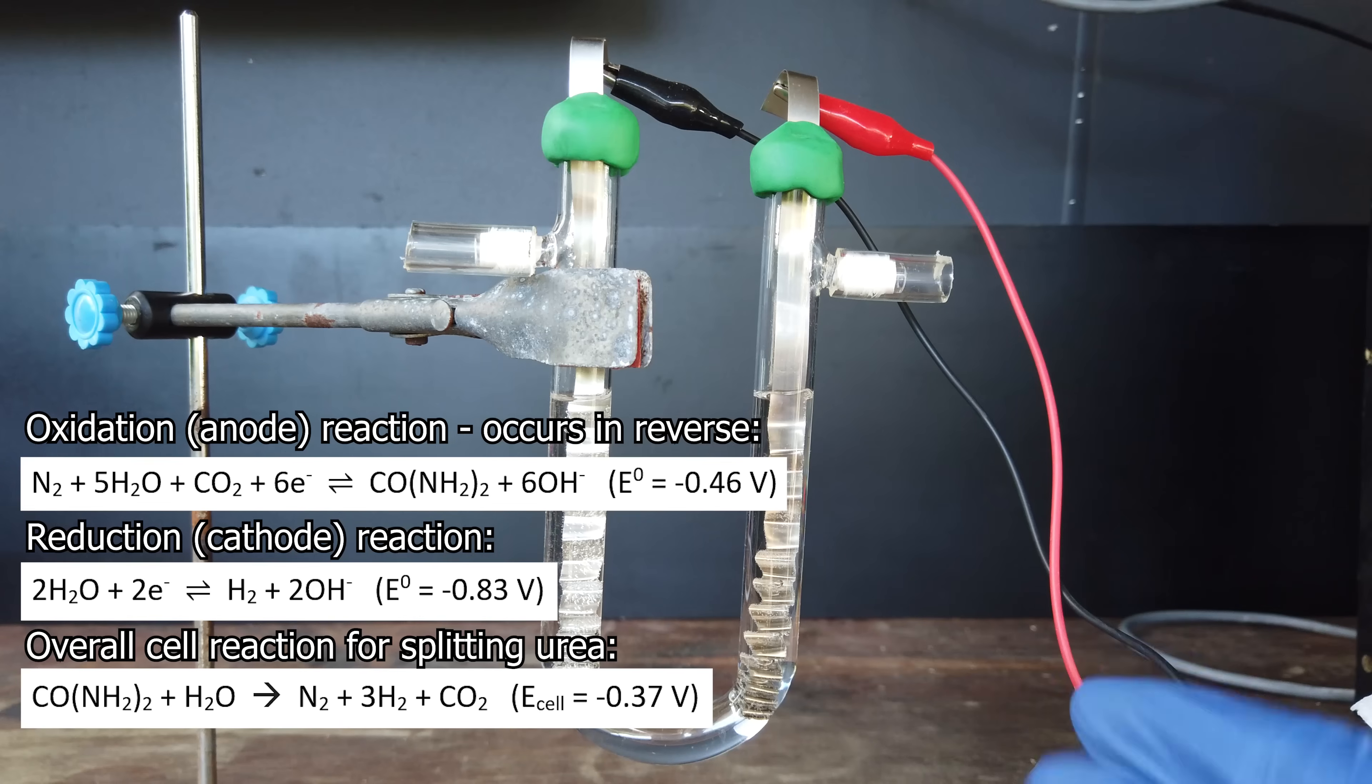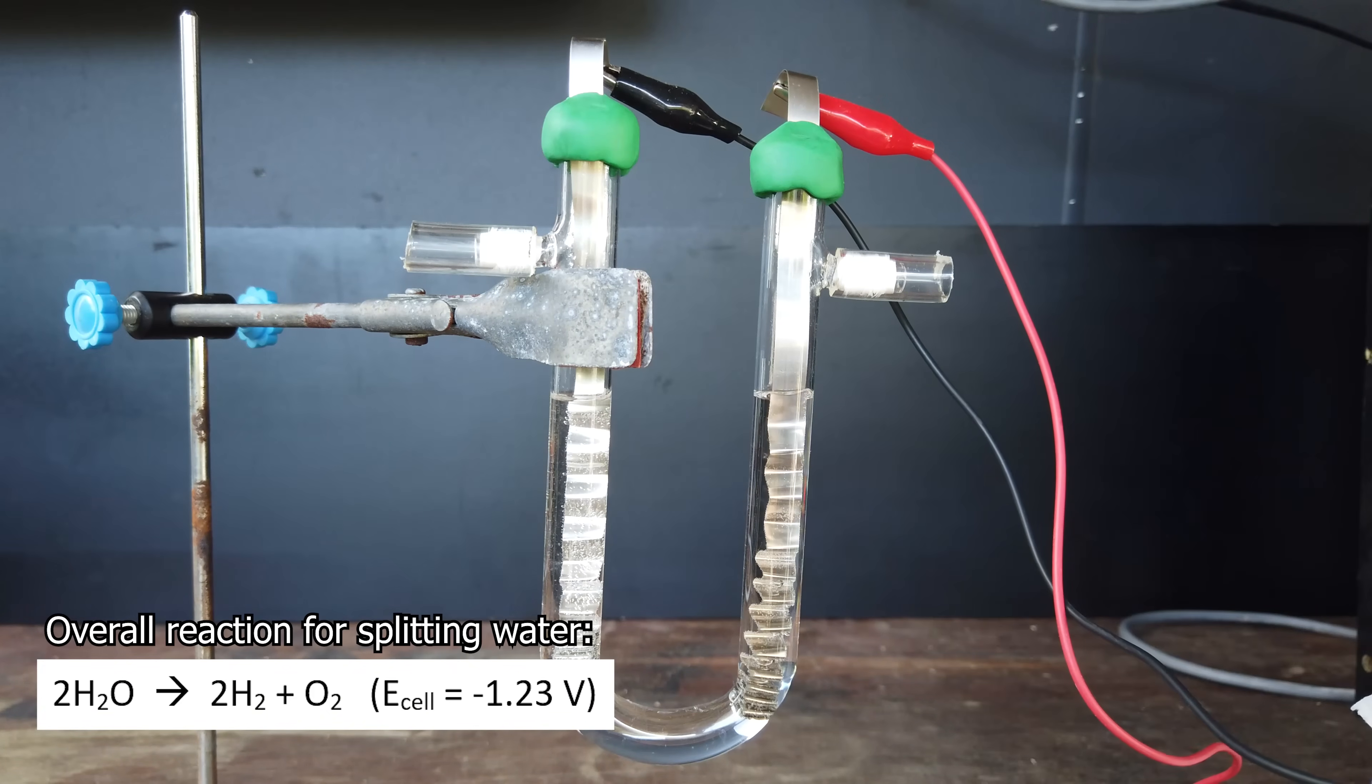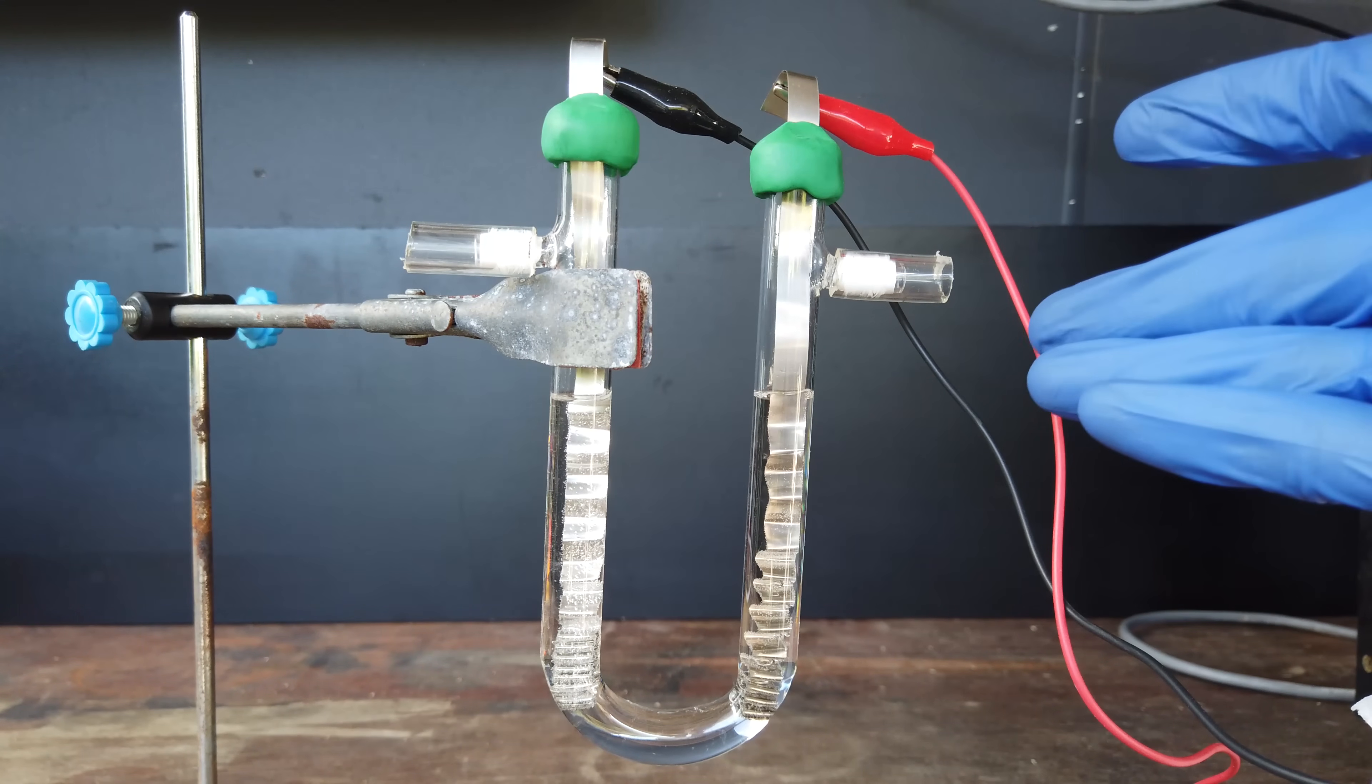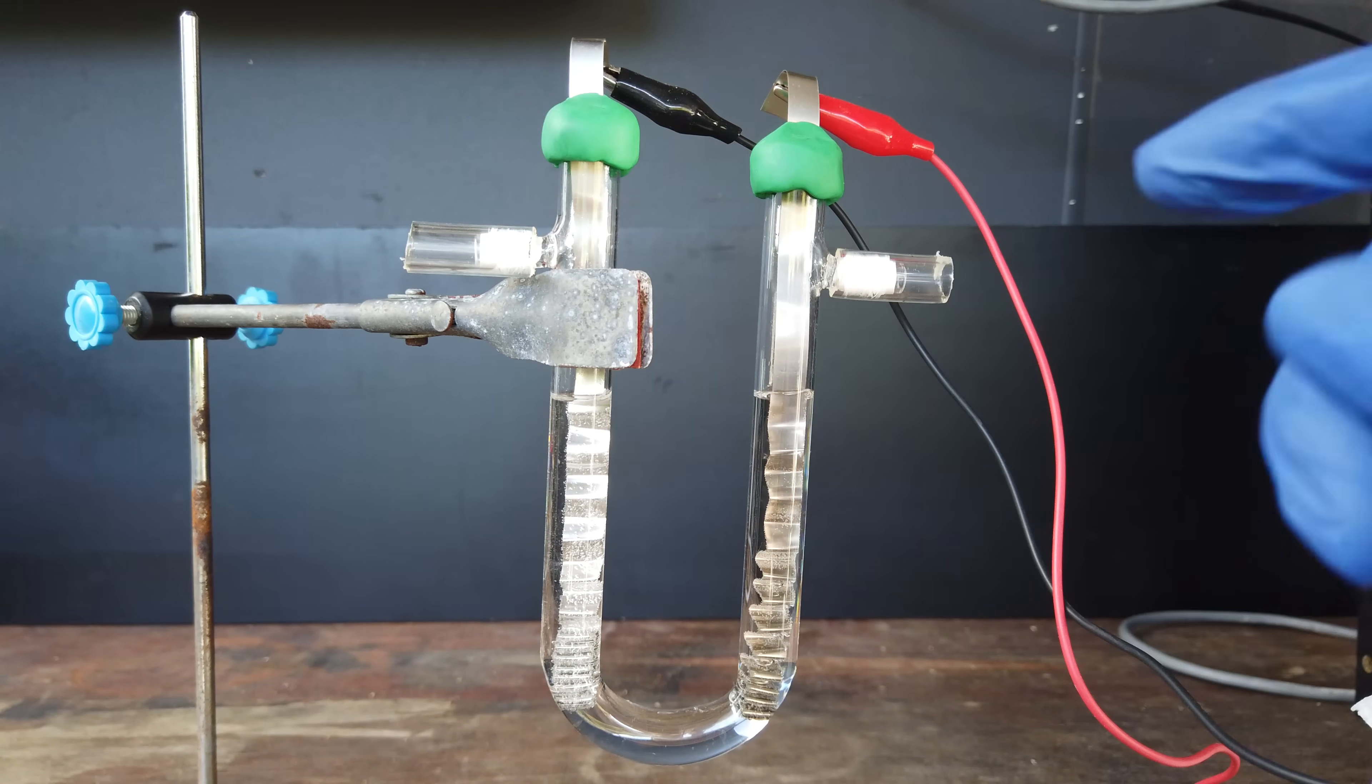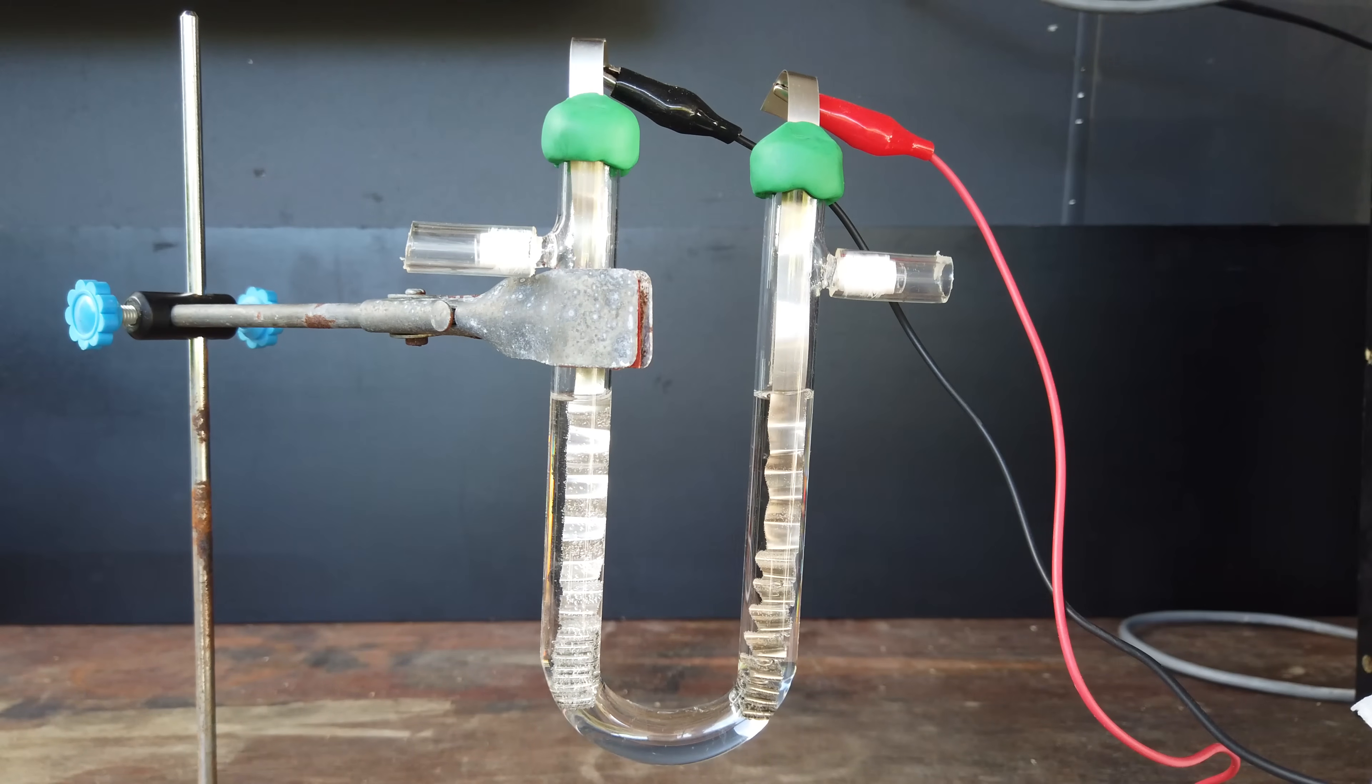The electrochemical splitting of water occurs at around 1.23 volts. So the basic gist of it overall is that on nickel electrodes, urea can be split electrolytically by voltages between 1 and 1.5, whereas above 1.5 volts, we start to get electrolysis of water occurring, and instead of generating exclusively nitrogen gas, we start to generate oxygen alongside that.